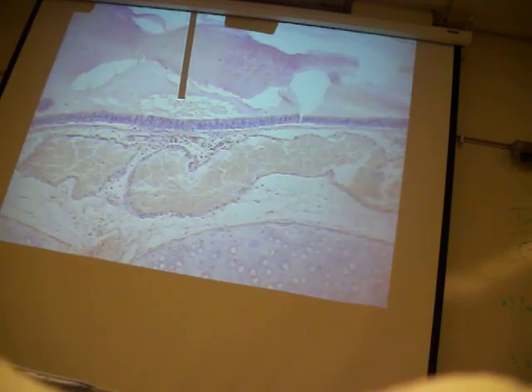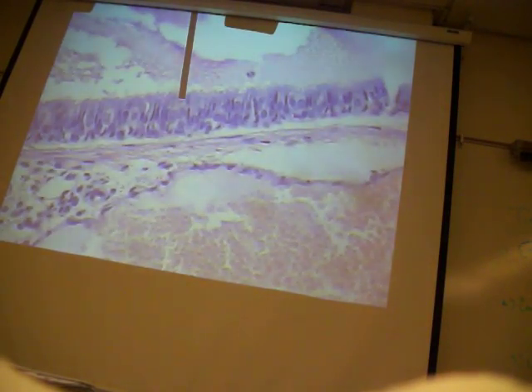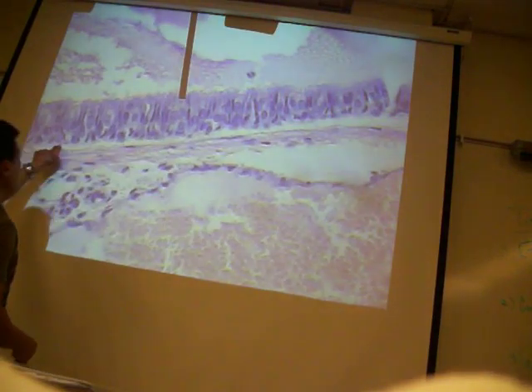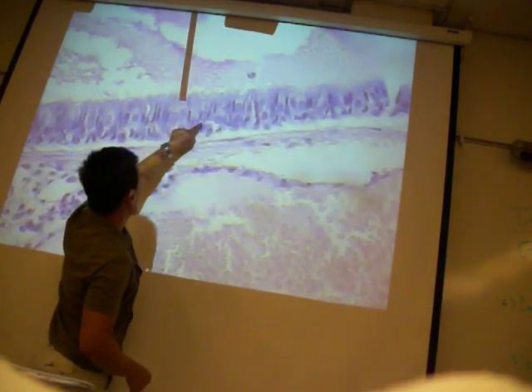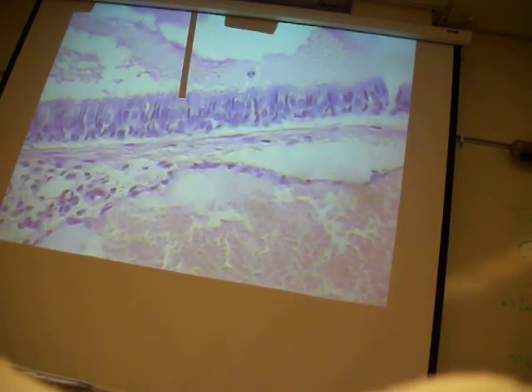It's pretty durable. So we got some cartilage down below. So here is pseudostratified. If you look at these cells right here, you can follow all of them down, and they're all going to attach right down here to the basement membrane. But you'll see that the nucleus on some are lower, some are much higher. They're kind of squished around. These pseudostratified cells are found in areas where there needs to be a little bit more protection. So, part of your bronchial tubes, that upper respiratory tract. The epididymis and the vas deferens are examples of areas where you'll find this. So you need that little extra durability.